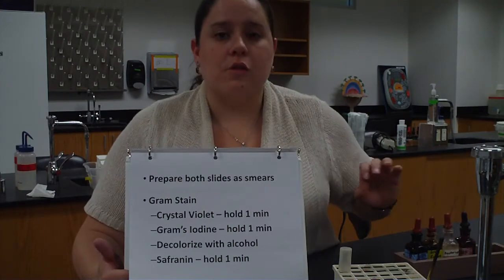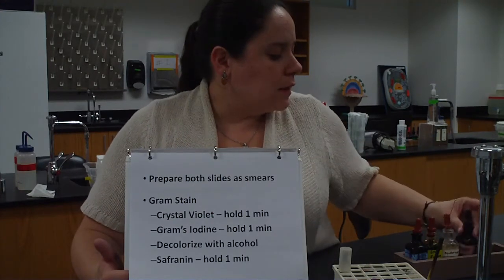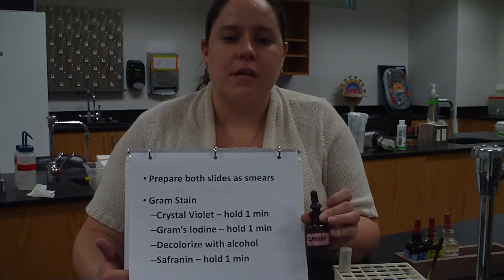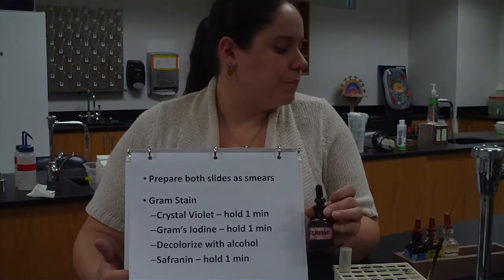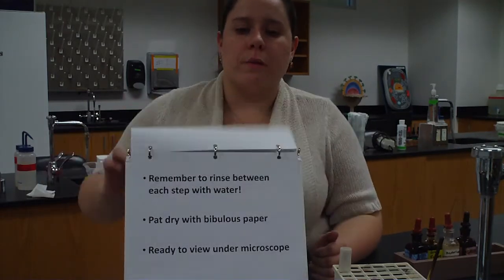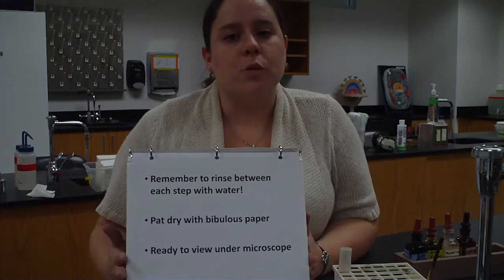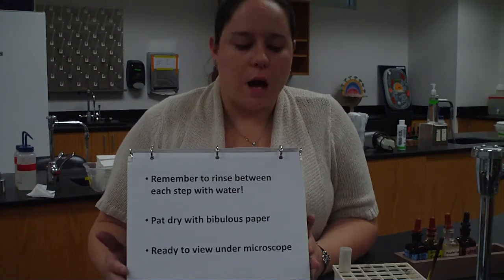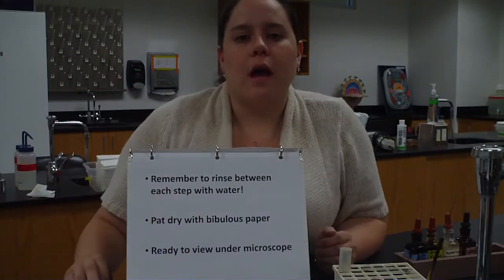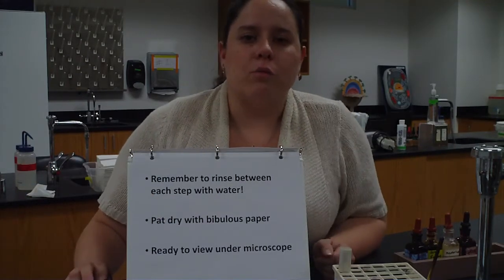Once we finish with the decolorization, you rinse with water, and then the last step comes along, which is the safranin. So you're going to flood the slide with safranin and hold it for 1 minute. Once that minute is up, you then rinse with water, and you would dry with your bibulous paper. So just make sure that you rinse between each step with water, and then we pat dry with our bibulous paper, and then it should be ready to take a look at under the microscope. So let's take a look at how that looks.